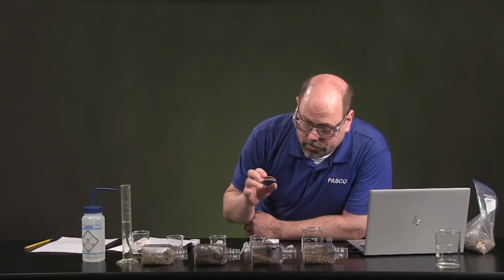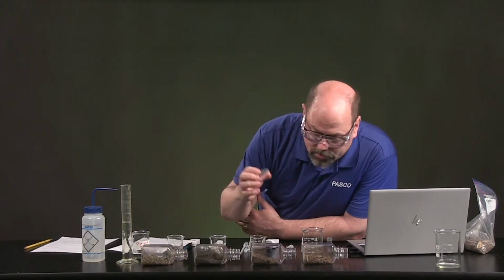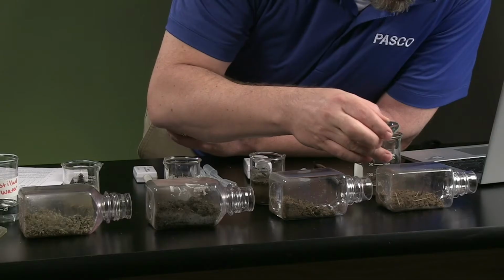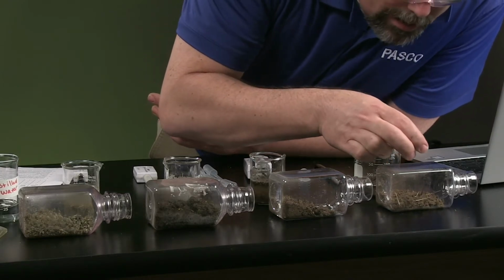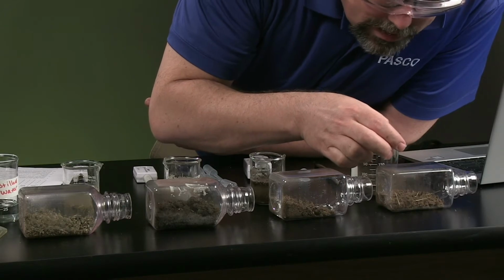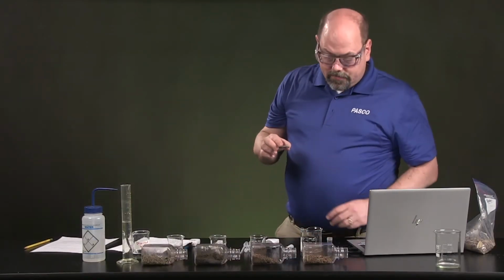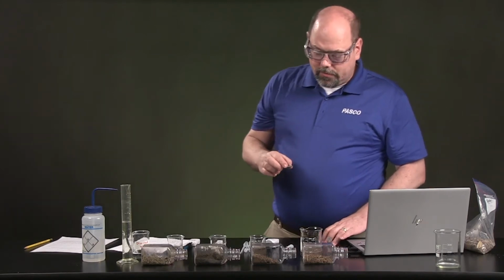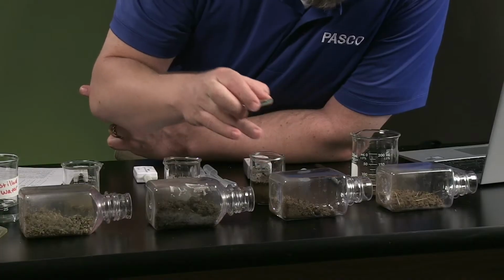Usually those are richer and darker than, let's say, river bottom soils or something along those lines. It does have a grayish look to it. Lots of roots that I'm looking in there. I'm looking closely. I don't see any sand. Really, it's clumps that if I break down, it's very fine parts that if the wind was blowing, it would be almost like dust.